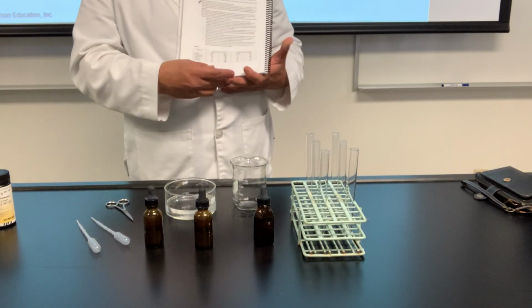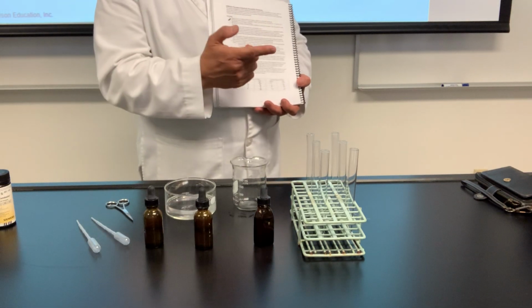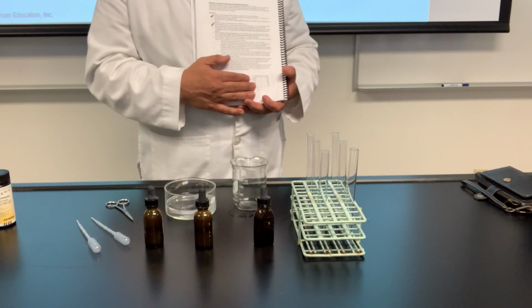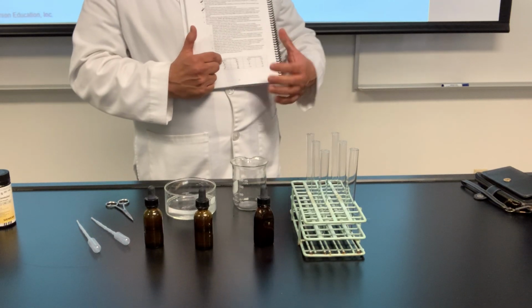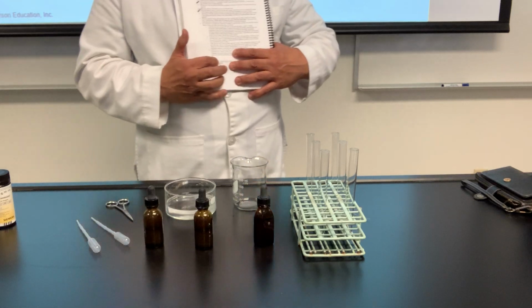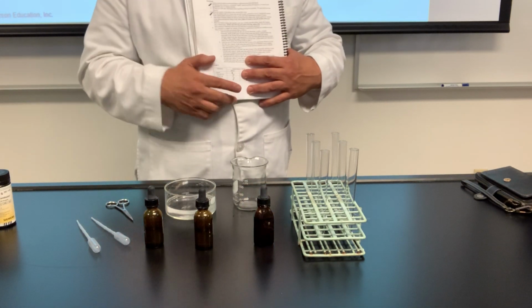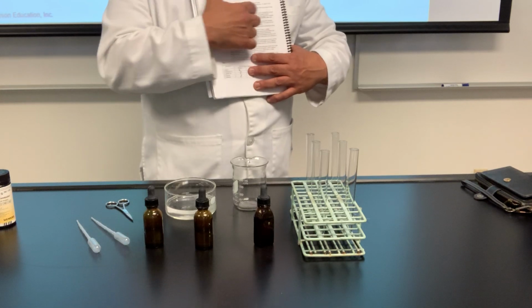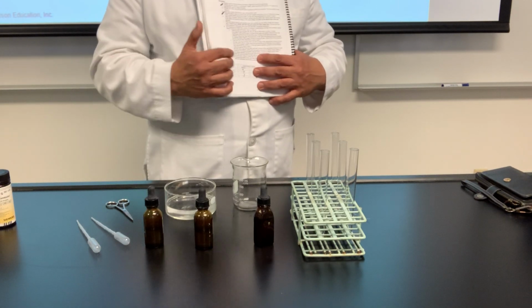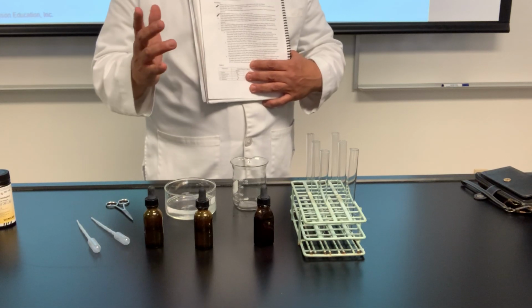So for example, something like glucose. Glucose is inside the bag at the beginning. So we're going to write plus. In your table 1, we're going to try to figure out what's inside the bag when we first started, whatever it is under step 2. So you're going to use pluses and minuses. Plus means present, minus means absent.